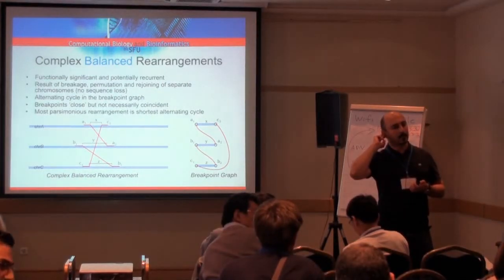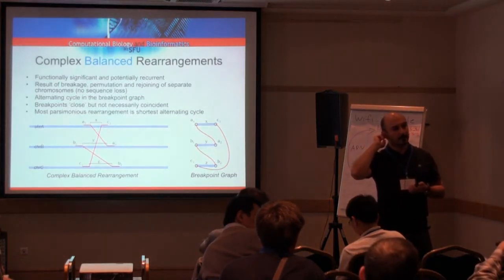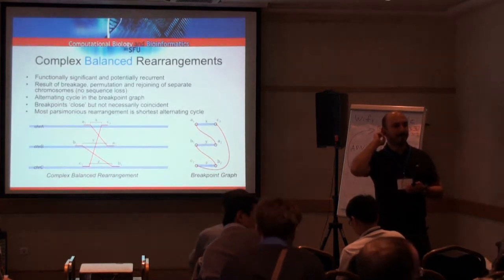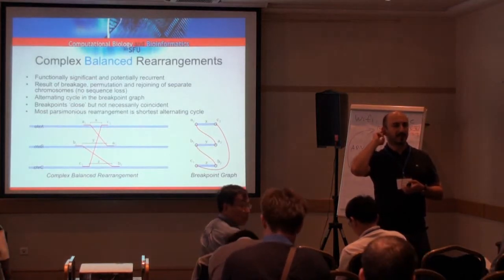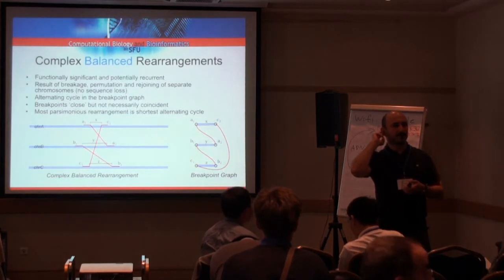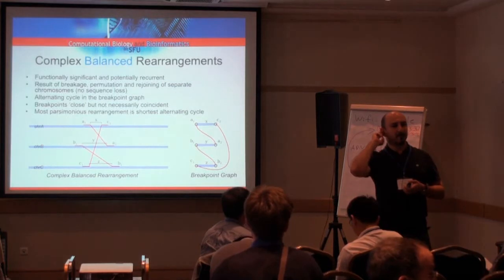The problem is also that if you look at BAM files today, about 40% of the data is identifiers. Unless you come up with a less stupid way of making identifiers, and only about 10 to 12% is actual sequence data, even if you achieve 10 times compression, it's not going to achieve the compression.